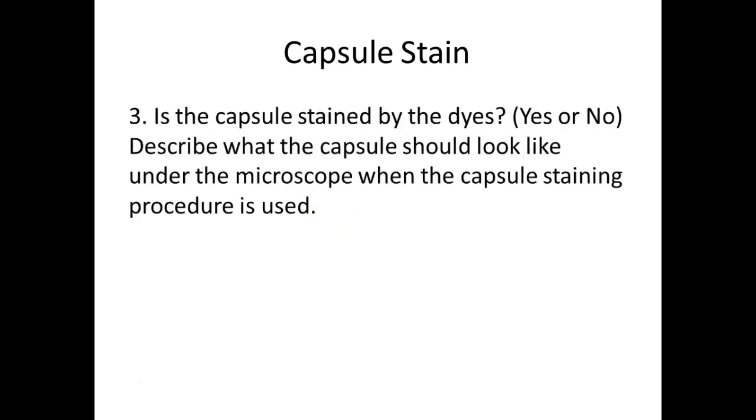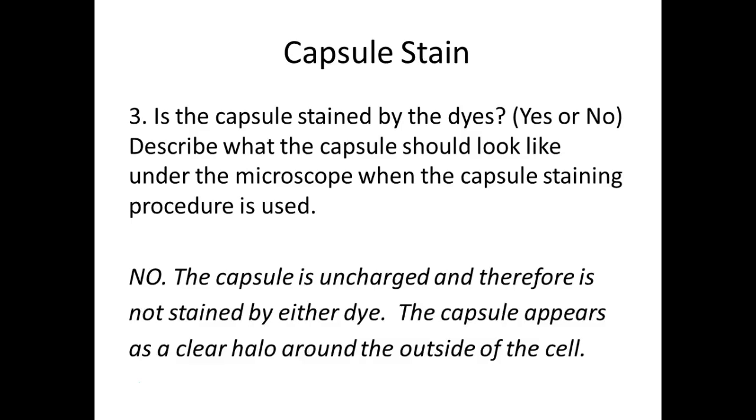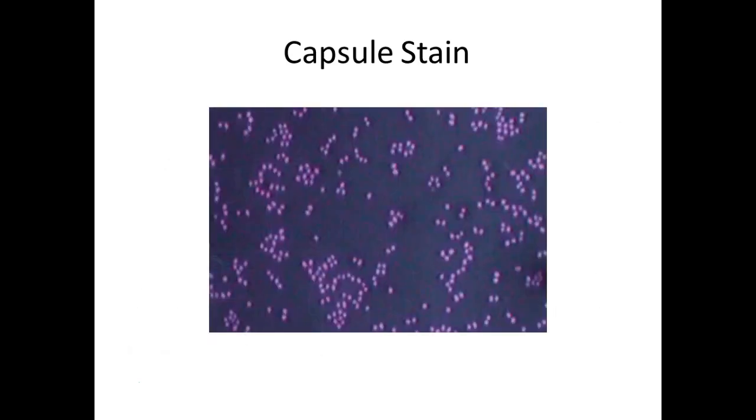So, is the cell stained? I mean, is the capsule stained? Sorry. No, right? The cell and the background are. The capsule is going to appear clear around the outside of the cell.